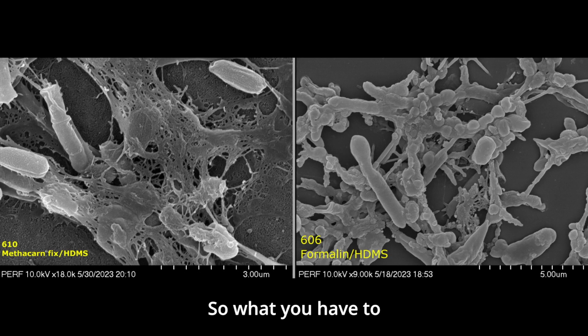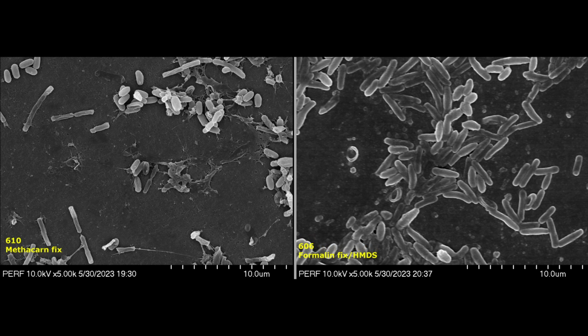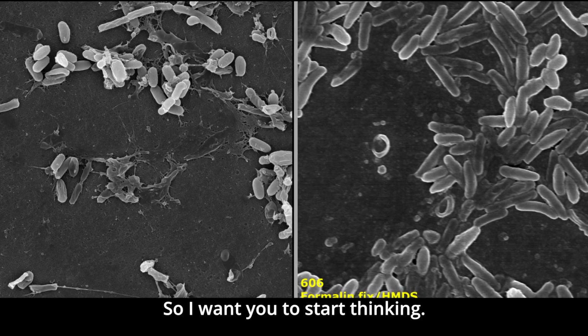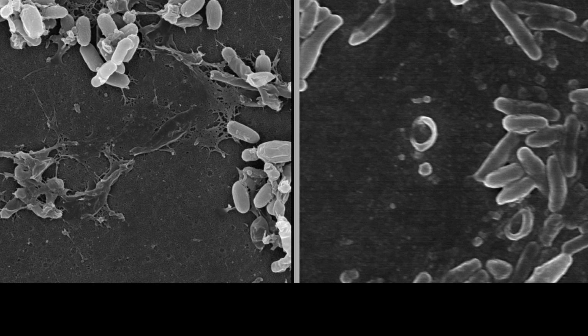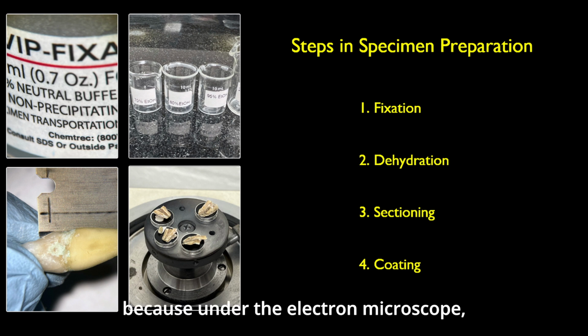Most of our specimens are fixed in formalin. So what you have to understand is when you look at a formalin-fixed specimen, there is a lot of missing information that you don't see because it is not preserved by the fixative. It is washed away, so to speak. So always in your mind should be, what is missing from this picture? So I want you to start thinking, and when you consider images, you want to know something about how the specimen was fixed.